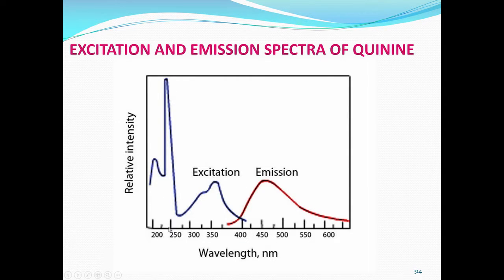And then there are other wavelengths, there is one here and one here, but that is not very important, because if you look at the emission wavelength, it starts from about 350. This is a very special case, somewhere around 375, the excitation is around 200.